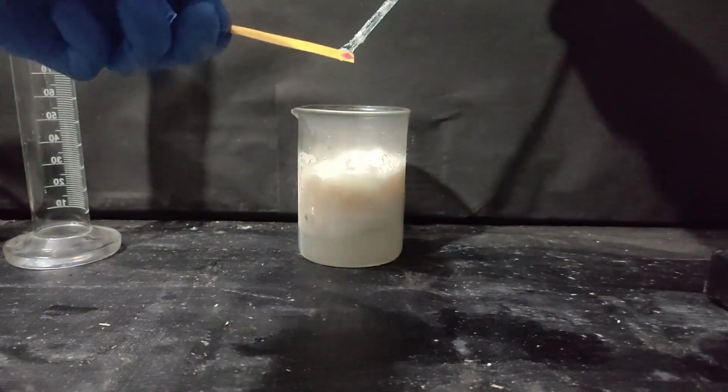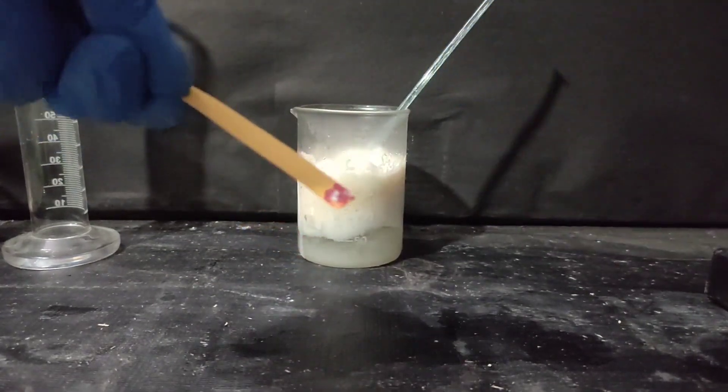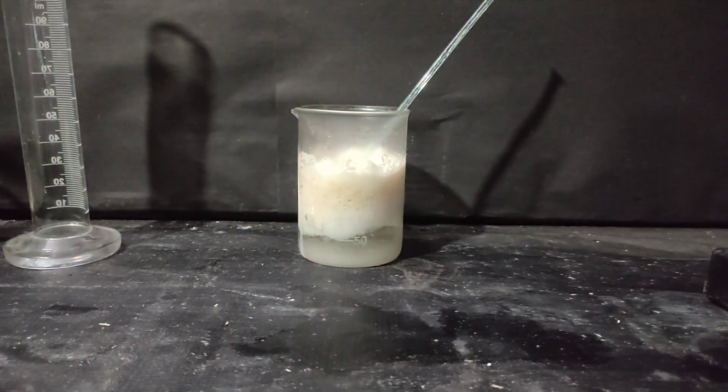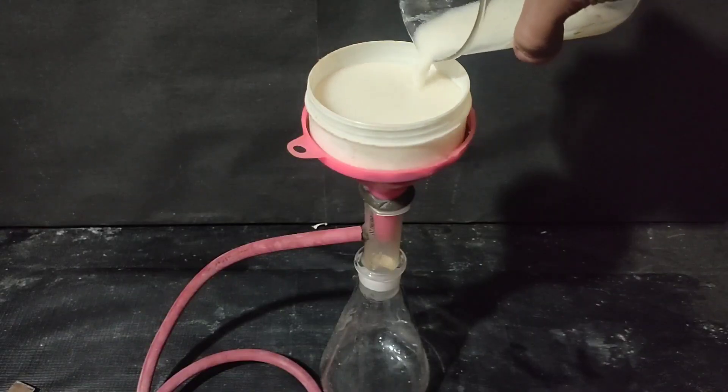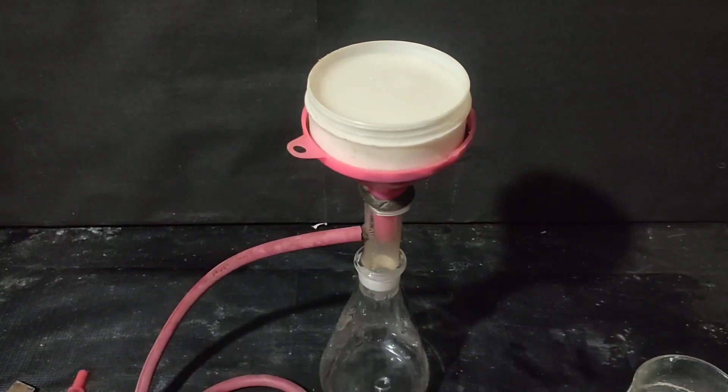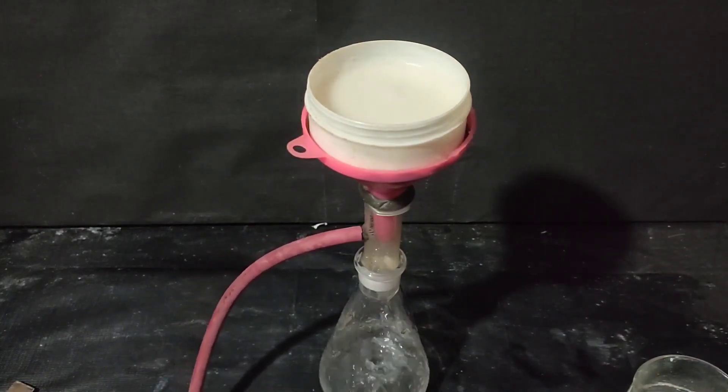The solution was hot so it was cooled first and then the precipitate of benzoic acid was filtered off using vacuum filtration by my DIY Buchner funnel and vacuum pump.